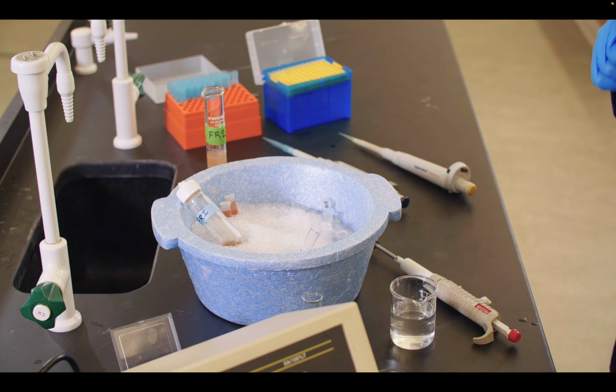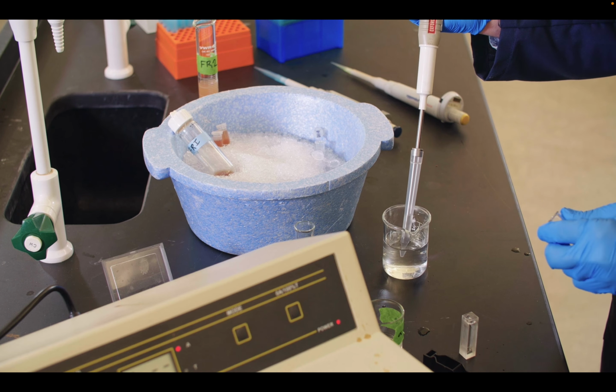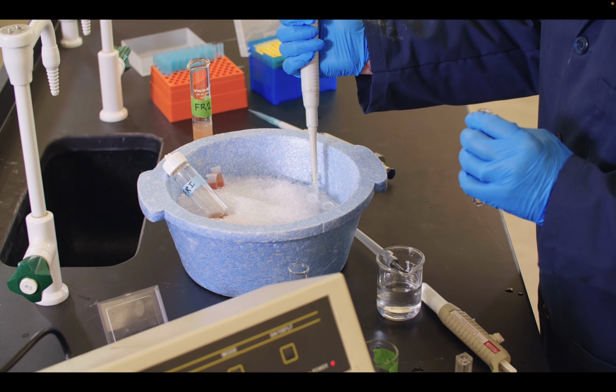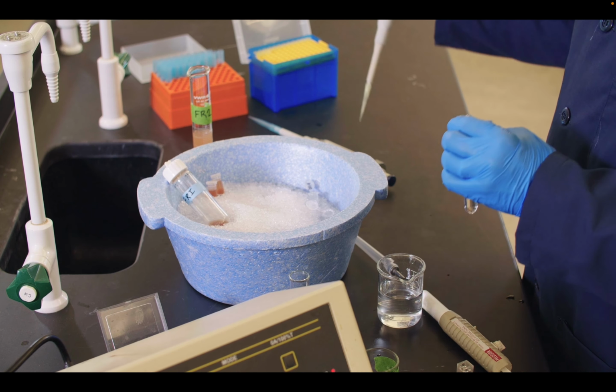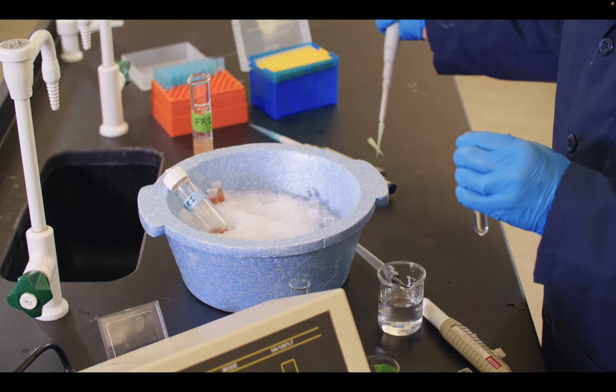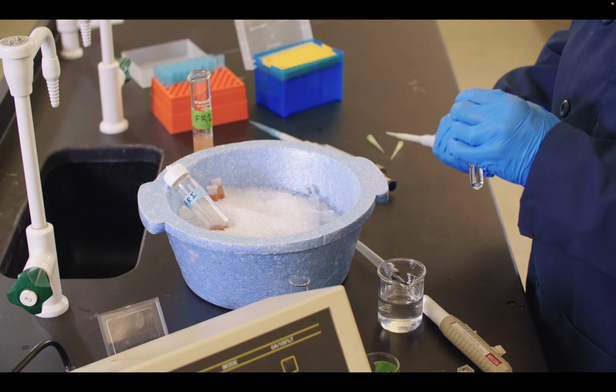Our assay is going to be very similar to last time for the GOT, except we change buffers. We just have a phosphate buffer, and that permits the GDH to react. Last time we used the aspartic acid, which helped us select for GOT. And we're going to add our MDH. Remember, the MDH is malic dehydrogenase, and that is an enzyme that is there for the coupled part of it. We add our NADH, our source of absorbance at 340 nanometers, and then also we add a little bit of our GOT dilution, the 1 to 160 dilution.